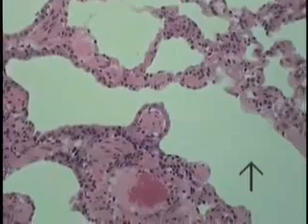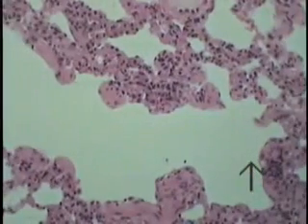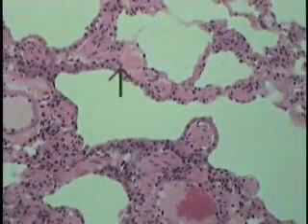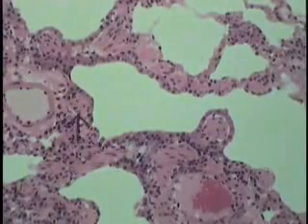And let's trace it. It has a fairly decent lengthwise cut through it, down to about where the arrow now indicates. What one will see is that the bronchial smooth muscle will now open up and form a more open spiral, a corkscrew type of arrangement. And if one just takes this area here, this is a cross-section of that smooth muscle bundle as it forms this open spiral.